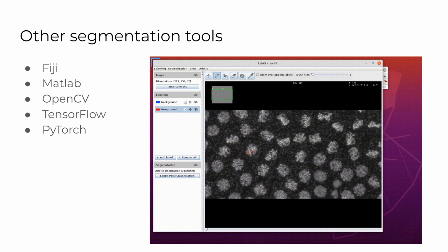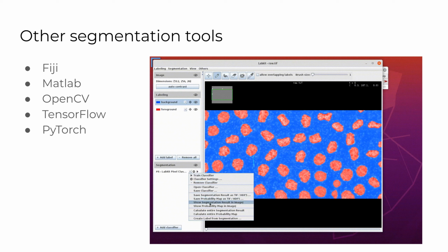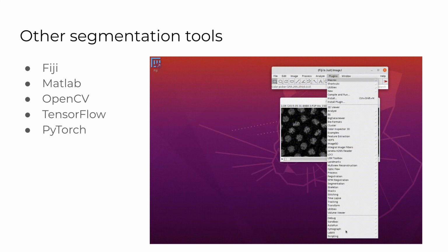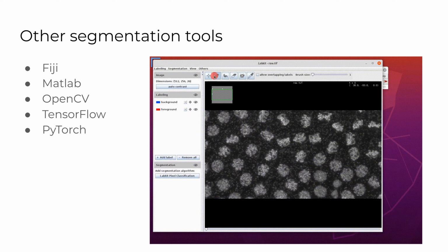You can use TensorFlow and PyTorch. So there's models out there, like when people publish segmentation algorithms, sometimes they would publish the TensorFlow and PyTorch models. Then you can just load those and use them, or you can tweak them as well. But this would involve you really dealing with the Python code and like really tweaking the models, okay, and playing around with those.